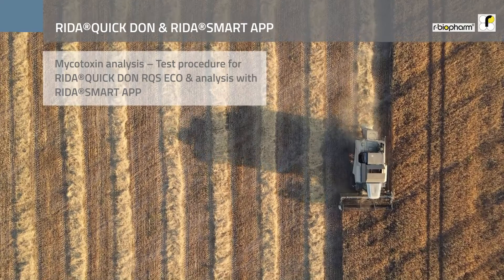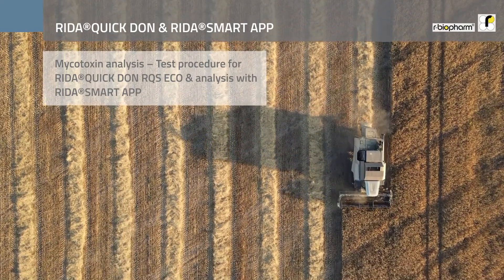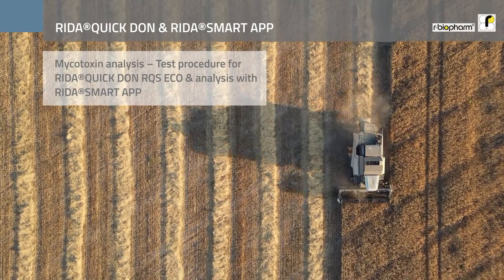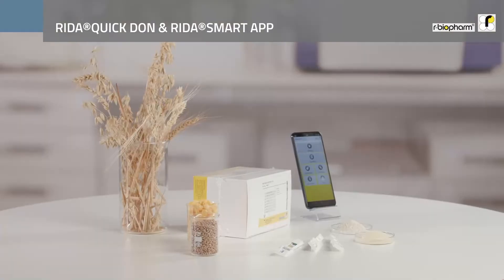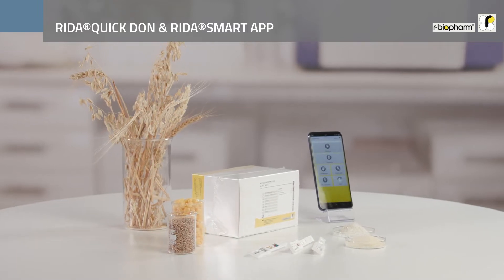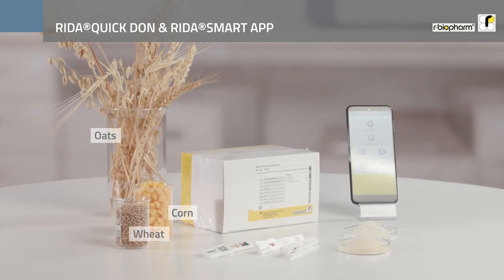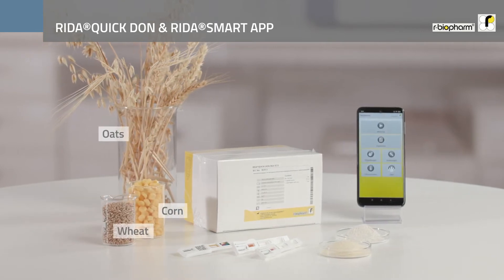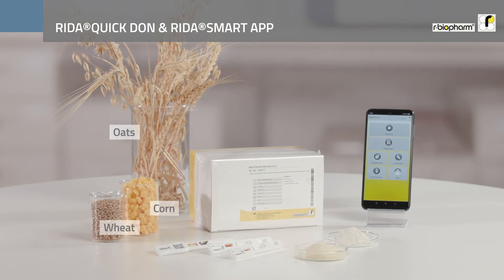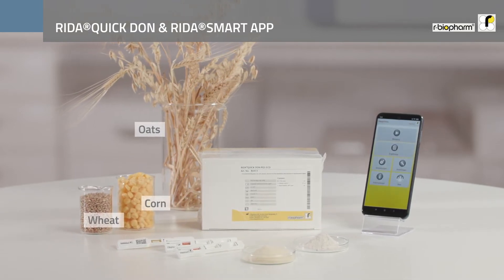In this video we want to guide you through the whole test procedure for RIDA QuickDON RQS ECO test and analysis with RIDA Smart App. RIDA QuickDON RQS ECO is a fast and reliable tool to detect DON contamination in different grains. It is the easy and mobile solution for testing raw materials in the field, grain elevator, mills, or incoming goods control.